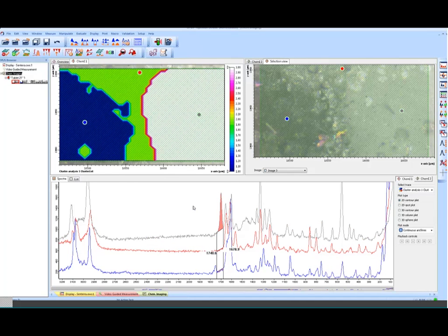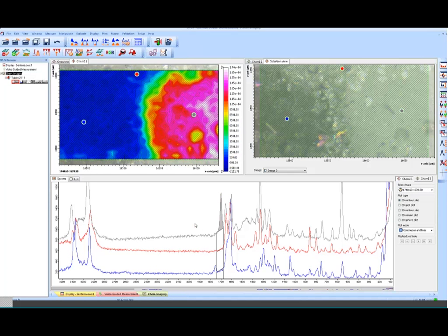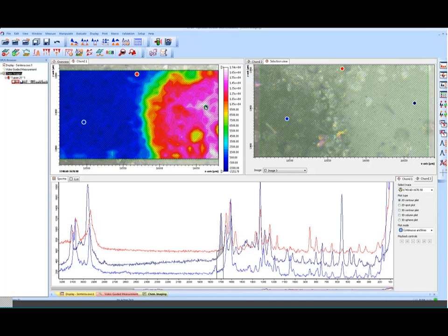This is done simply by a mouse click with a right click. You go to integration and say integrate. And then you see the distribution of this line across the area, high intensity here. So we'll have a strong band here. Maybe shift this again a little bit upwards.